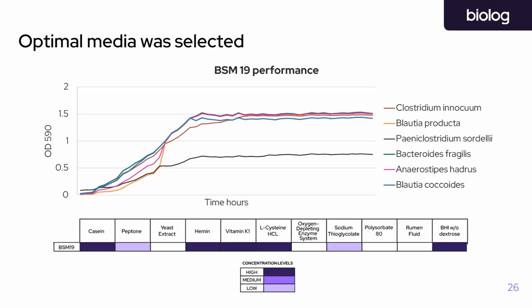The last one is asking about Odin. Is the Odin prone to microplate variability, such as edge effects? And do you address this in any way during the data processing? I'm not sure if we have that information in the slide deck here. That's not something I'm really familiar with, but Odin is very robust.